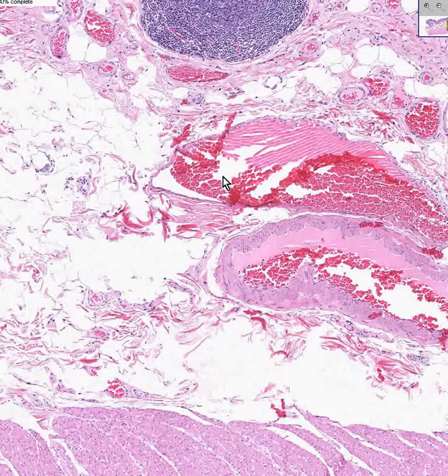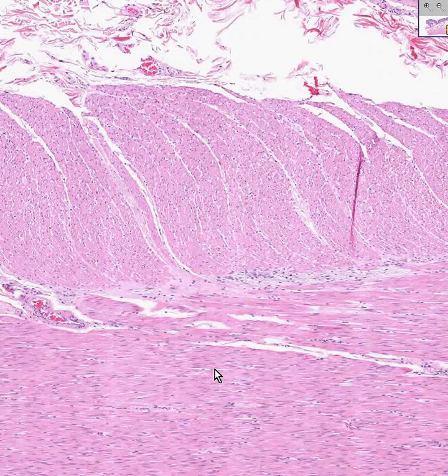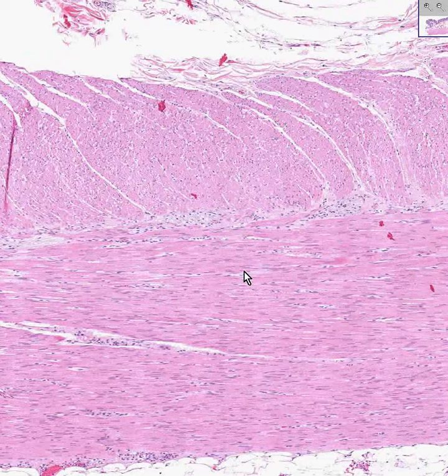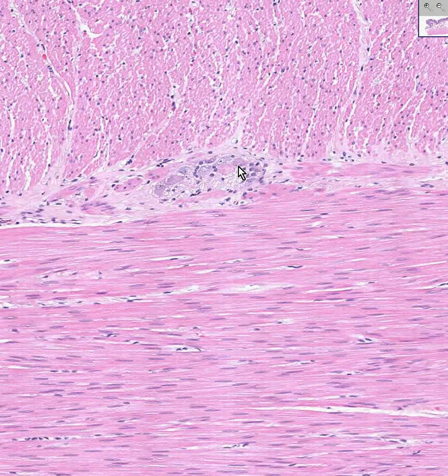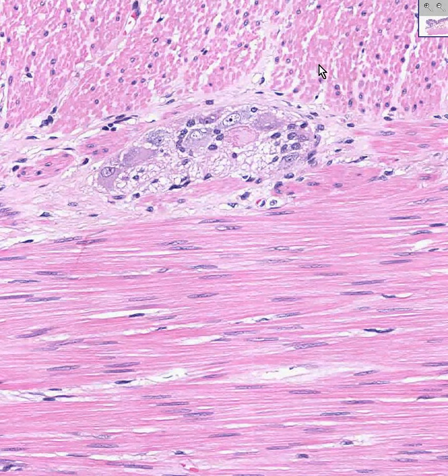Notice once again, you have another quite abrupt transition, and you can now see the beginning of your smooth muscle layers, circular on the inside, longitudinal on the outside. It is between the circular and longitudinal layer that you're very, very likely to find little ganglion cells, like here and here and here. This is the myenteric ganglion of the gastrointestinal system. That's where these are found. They're quite common. Another place to find ganglia, almost like a separate brain of the GI system, is in the, let's go back to that. These are nerve cells of the myenteric plexus.